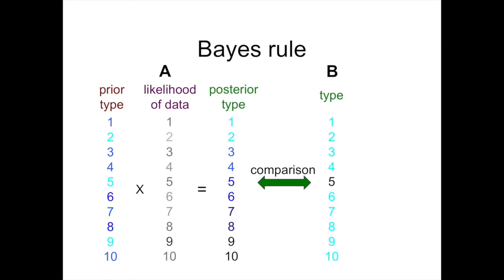How do you get those probabilities that I'm showing here in the middle as a posterior probability? The way it's done is one begins with a prior type that's shown on the left. That's what's in the population. That's the type of a random person. And then there's data, the STR data, and using math, the prior probability is updated with that middle column of the data, and it's called a likelihood. And that updating of the data, then you just multiply it together and then make the total come out to 1. That's what gives these probabilities that we then have comparisons with.